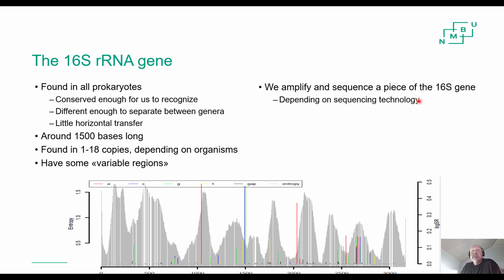Depending on sequencing technology, yes, because with, for instance, nanopore or PacBio sequencing, which is long read technologies, then you would typically sequence the whole. So this amplifying a piece is only relevant for Illumina sequencing, but that's the most common anyway, right?